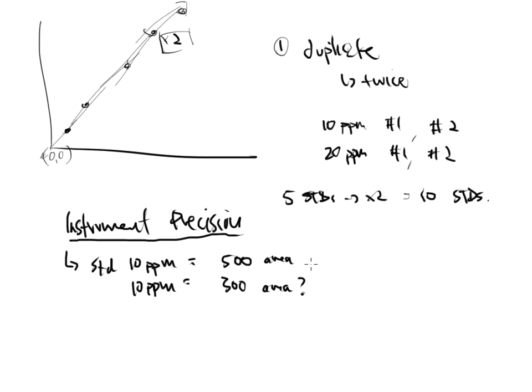Think about your computer. How many times have you randomly gotten an error? You had to shut the computer down and restart it. Those things can happen in an instrumentation facility as well. Very commonly seen in an analytical laboratory. So for that reason, some laboratories will want you to do duplicates, and that's what we call those.